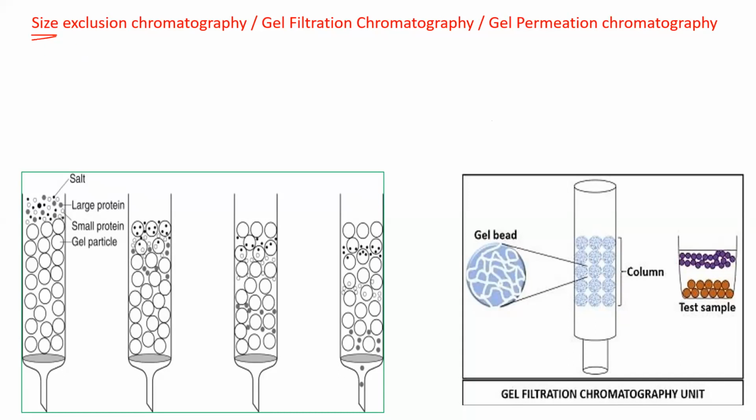to do the size exclusion chromatography. So when you are given an extract, that extract can be a mixture of small molecules, big molecules, different types of molecules, and they are going to be of different molecular masses. This technique is used to separate these different sizes and these different masses from each other. Now you can also use electrophoresis to do the same.